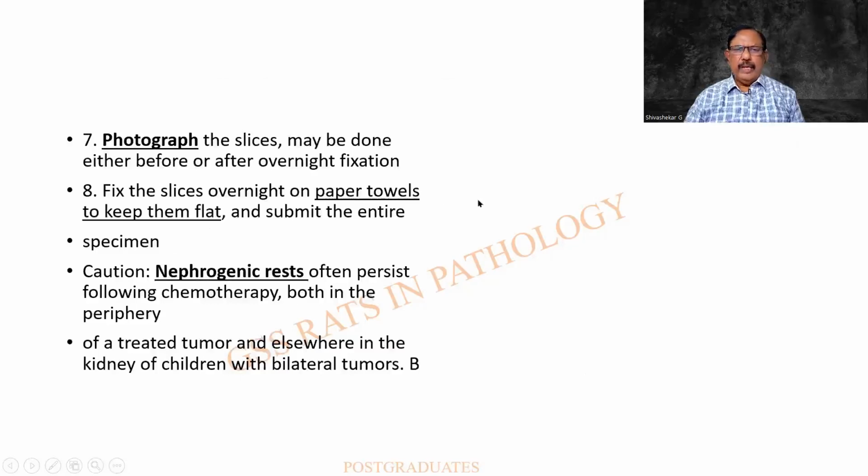Photograph. Paper towels. This is something of a good habit that we always do because the kidney is almost a solid organ which prevents percolation of the fixative. Therefore, paper towels are inserted in between the slices, which will help in the capillary action of seepage of the fixative. Nephrogenic rests often persist even after chemotherapy, and this will have to be borne in mind for recurrence.